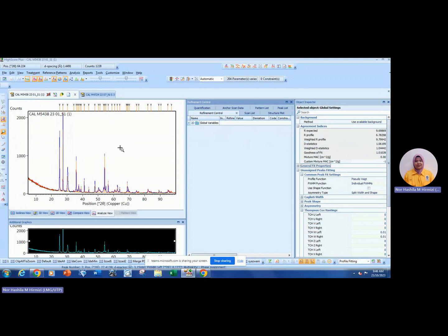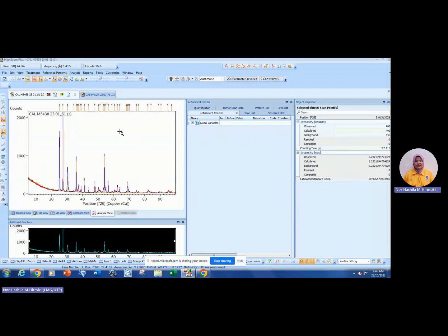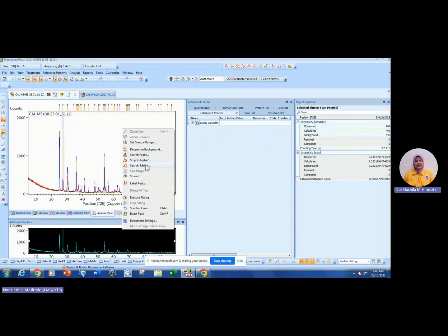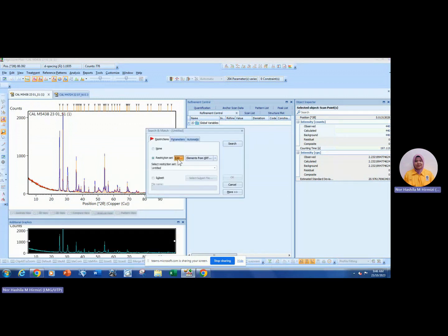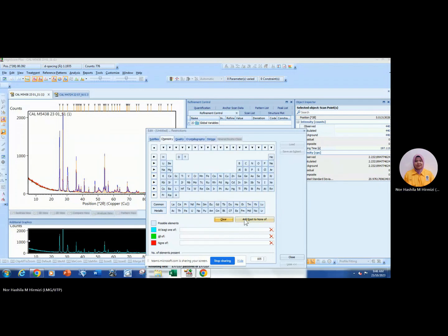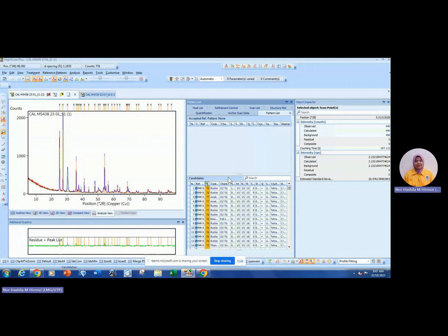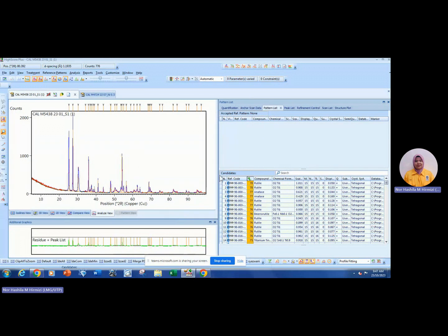Now your graph is ready to perform search match, which means comparing the pattern with the database. Right-click, choose 'Search Match,' click Edit. If you don't know what elements are available in your sample, set restrict to 'None,' clear the list, close, and then click Search. These are the results — the potential candidates for your pattern.